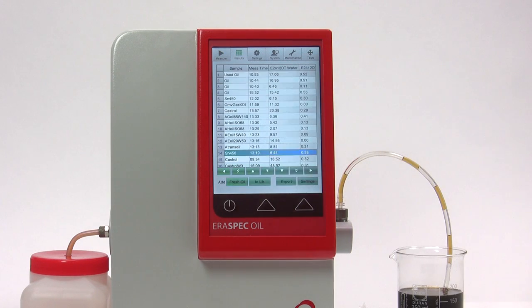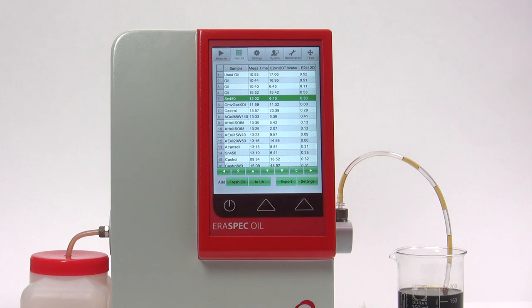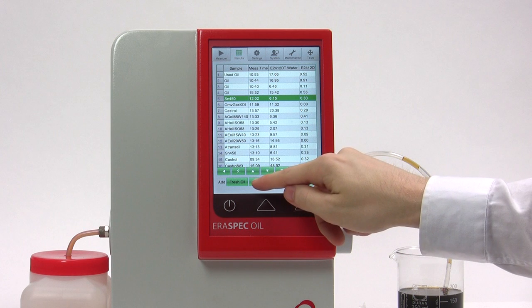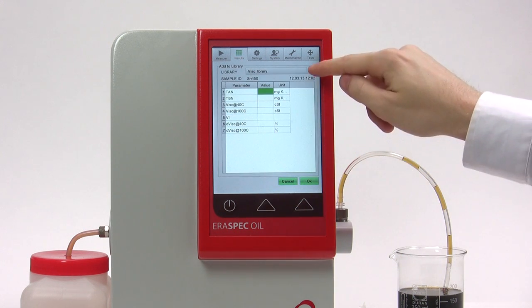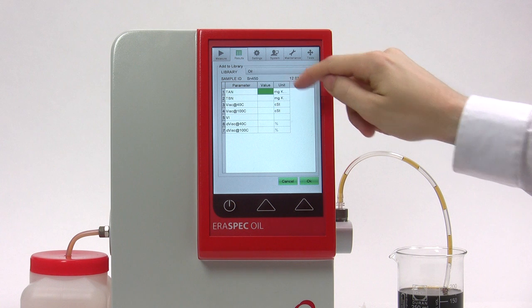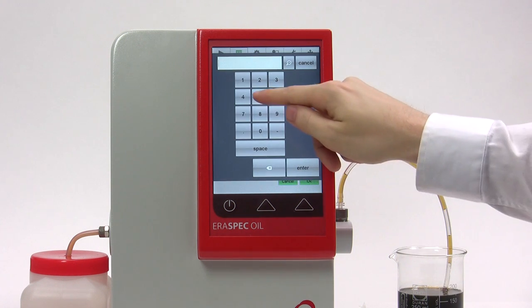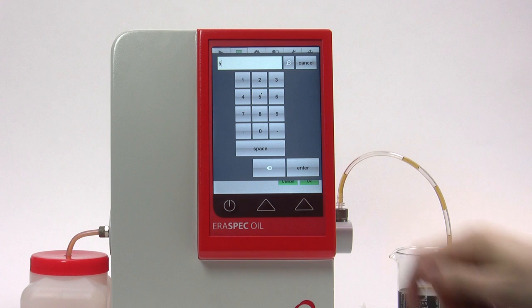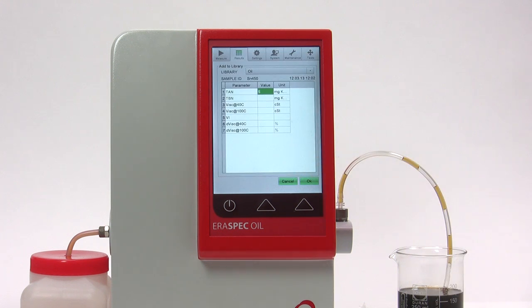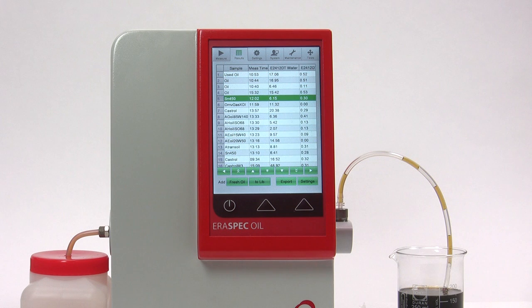To add a spectrum to the library, click on the Results tab, mark the spectrum where the complex parameters have been obtained by the corresponding reference methods, and click Add to Lib. Select the desired library from the drop-down menu and type in the values of the parameters determined with the corresponding reference methods. By clicking OK, the new values will be added to the library.